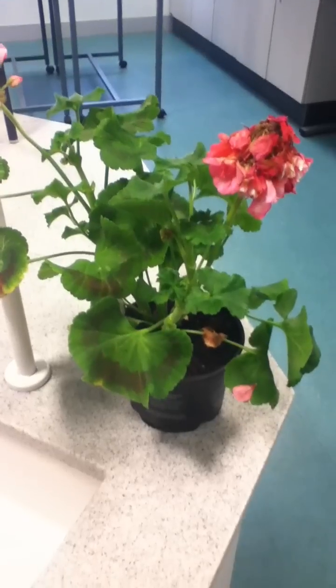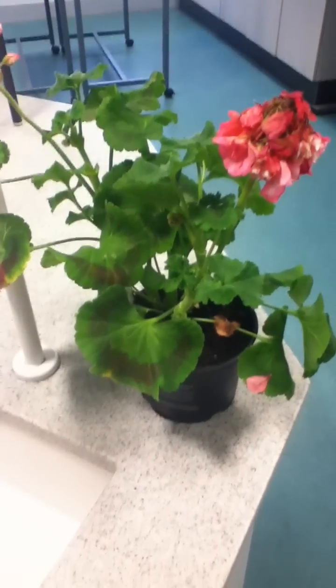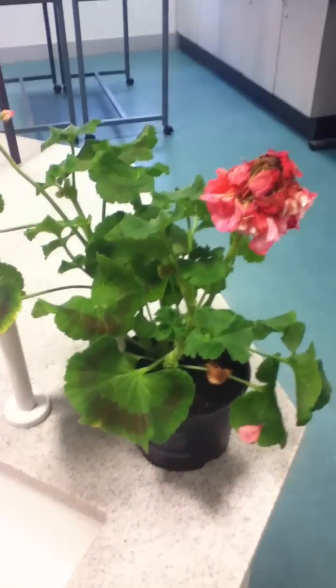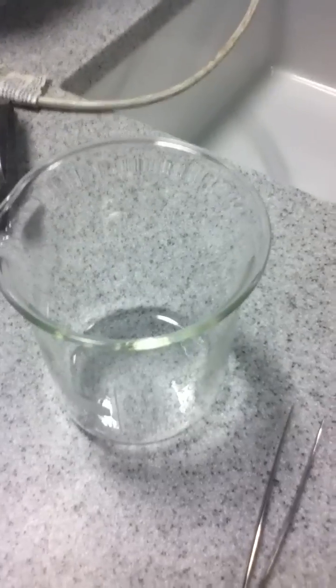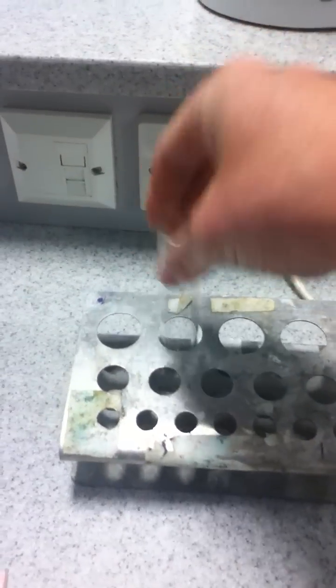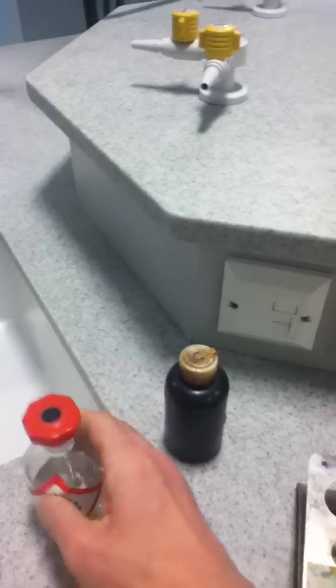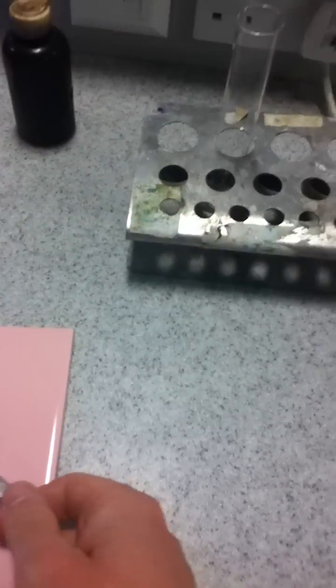Good morning Year 10. This is the basic method for proving that leaves store the glucose they're making in photosynthesis as starch. Here's some of the equipment you're going to need: a kettle with freshly boiled water, a beaker, a metal test tube rack with a big boiling tube, some iodine solution, some ethanol, a leaf on a ceramic tile, and also some forceps.